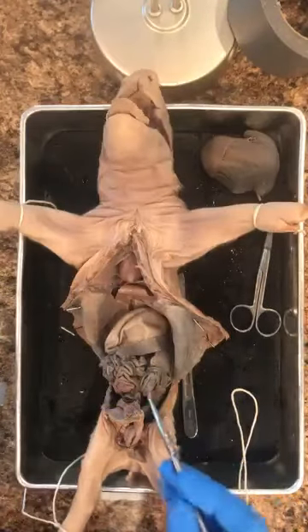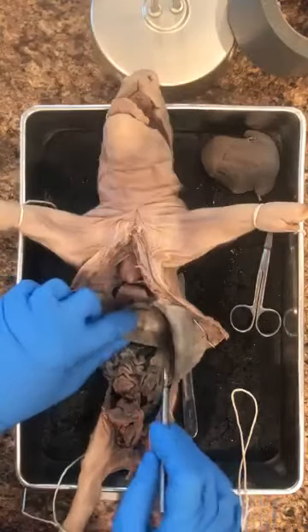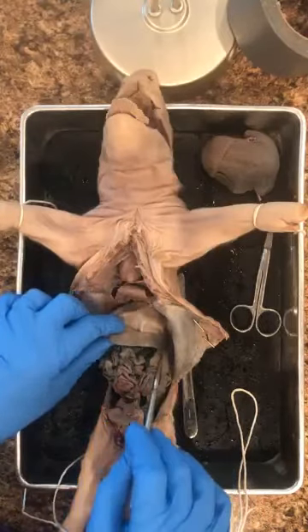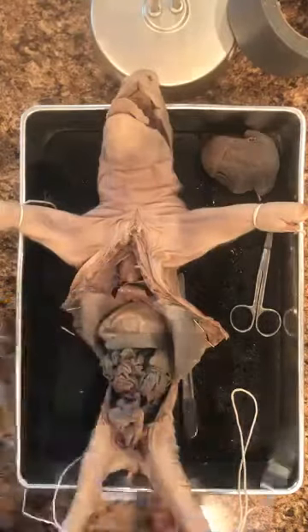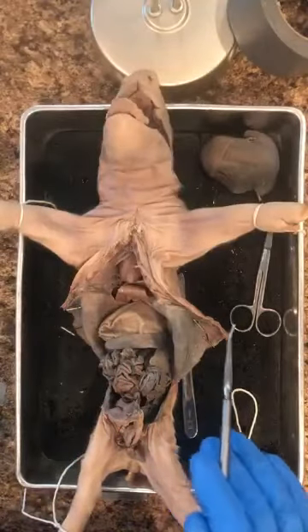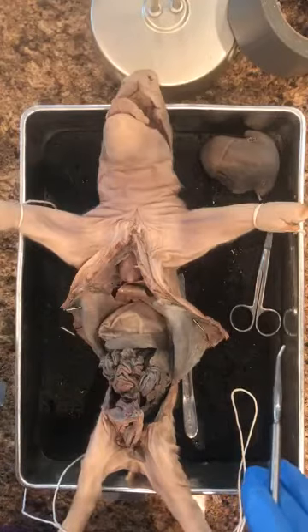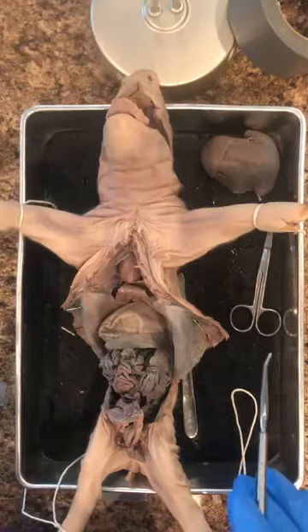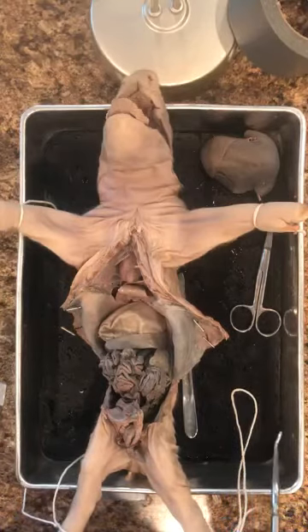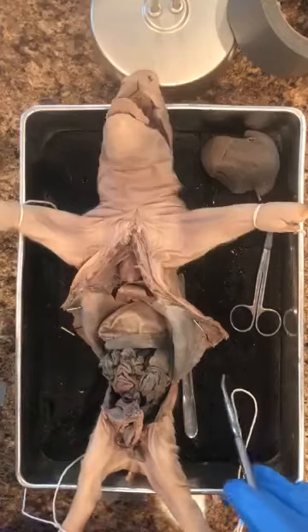Okay, attached to the stomach on the left side, again, not our left, the pig's left, is this long organ, it looks kind of like a finger, it's brownish here. This is the spleen. The spleen is not part of the digestive system. It is going to clean the blood by recycling old blood cells and removing bacteria. So it is essentially a link between the circulatory system and the immune system. And the cleaning function here is different from the kidney and the liver.